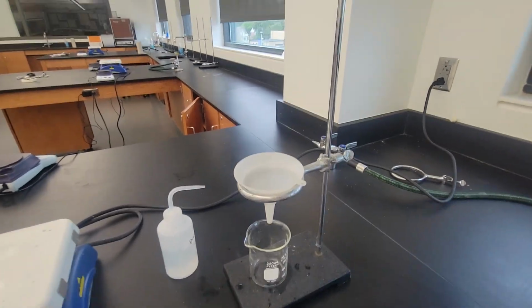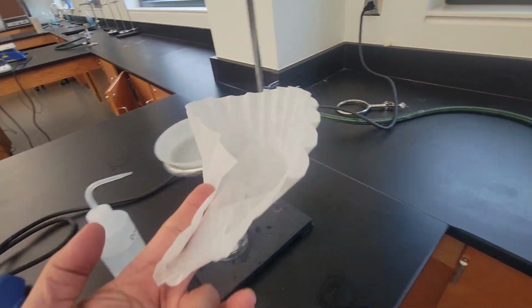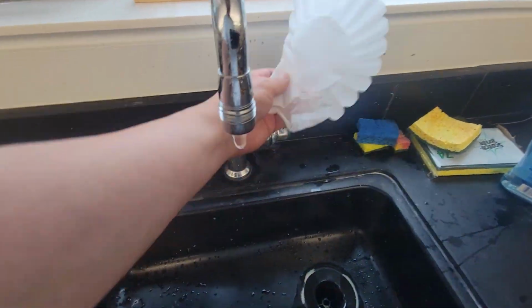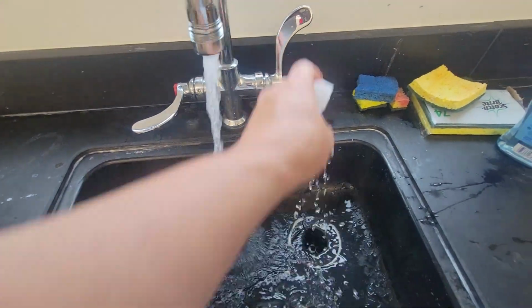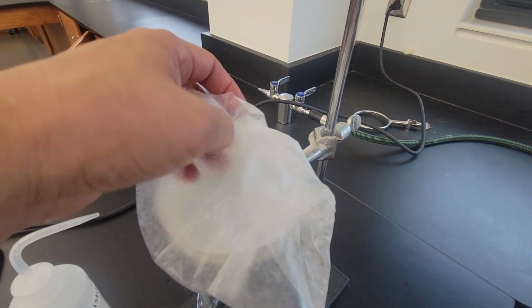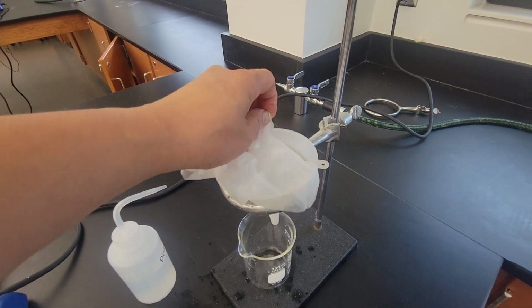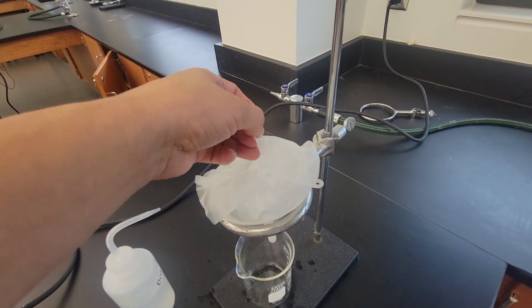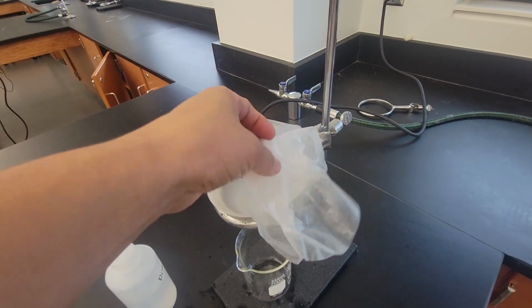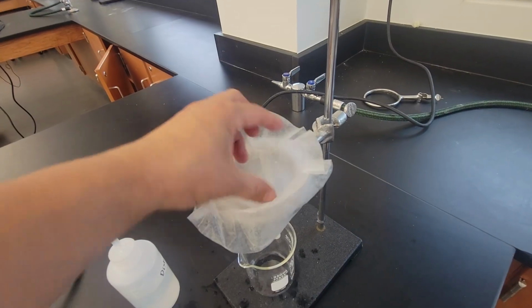All right, so I have here a filter set up. And I got a coffee filter. I'm gonna wet this filter paper. That way it'll stay in place when I pour my mixture through.